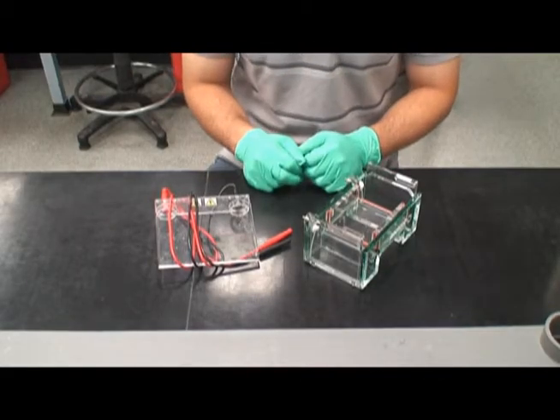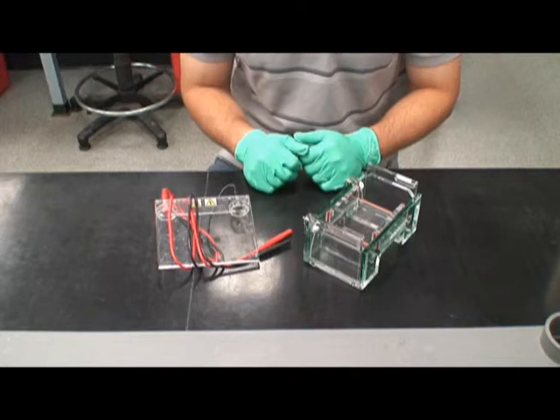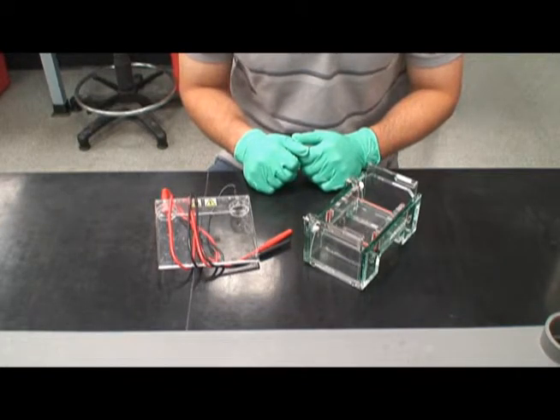An agarose gel and an electrical current can be used to separate DNA by size. This is called gel electrophoresis and will be used in this lab. This video reviews how to create a proper gel.